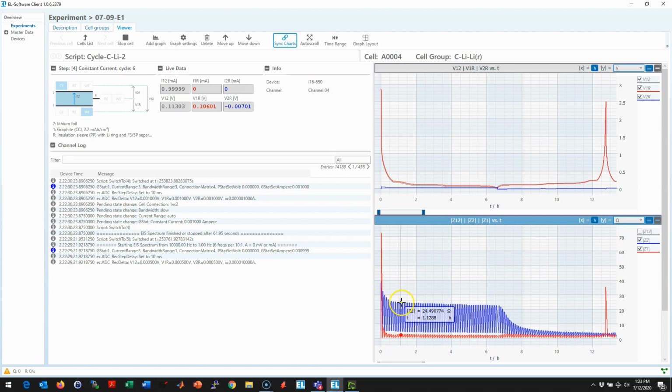So at low frequency, the upper point of the envelope of the blue curve, this is for low frequency, and you see this large impedance here, much bigger than the impedance of the graphite electrode. And only when we change the sign of current, when we start to delithiate the graphite and put the lithium as a dendritic porous layer on top of the lithium metal electrode, then the impedance of the lithium metal counter electrode is steeply dropping.